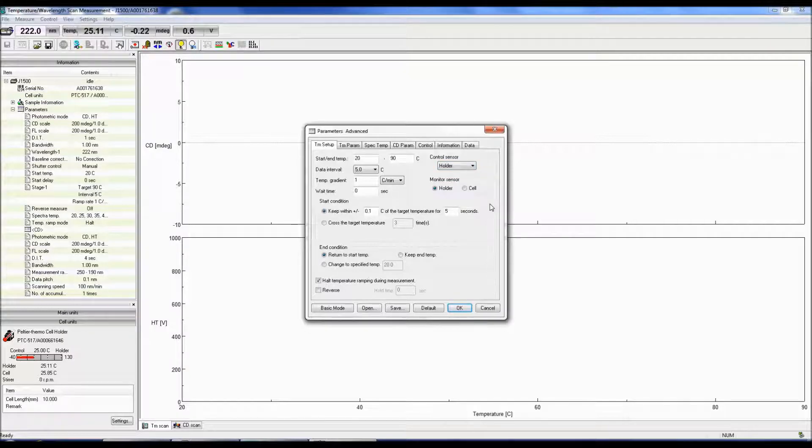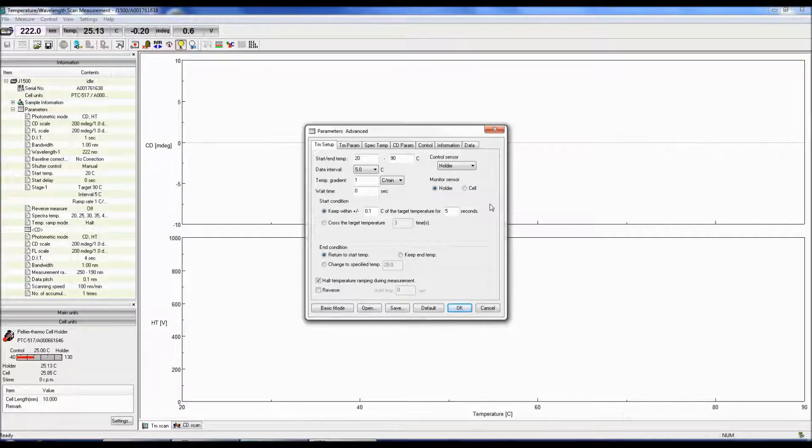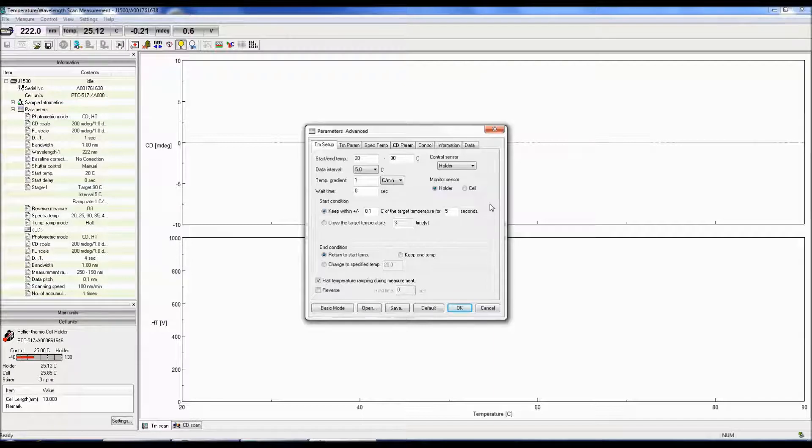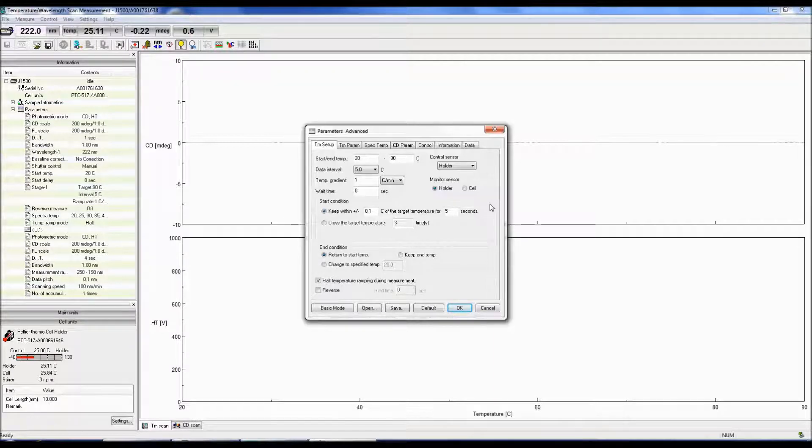Prior to starting the measurement, you can either select to keep the temperature within a specific range of the start temp for a specific amount of time, or you can start the measurement after the temperature crosses the target temp for a specified number of times.